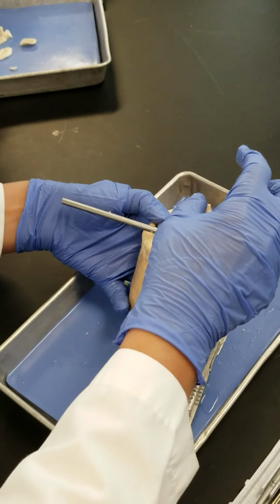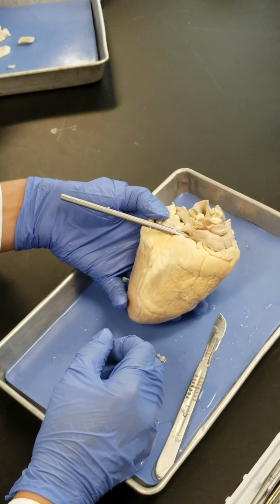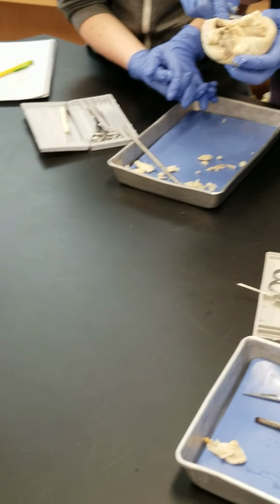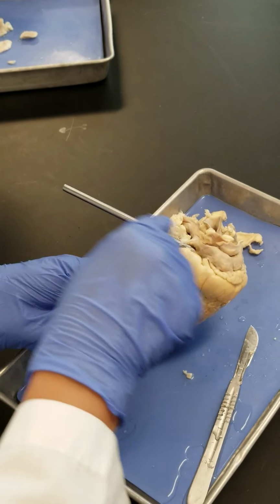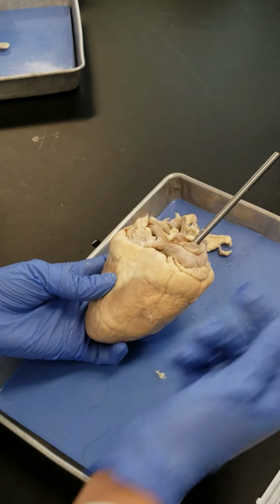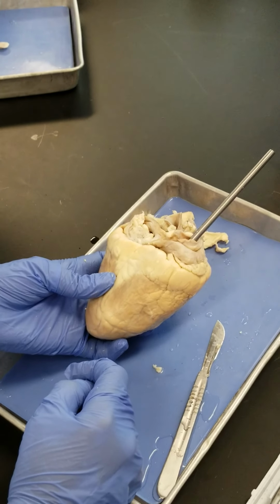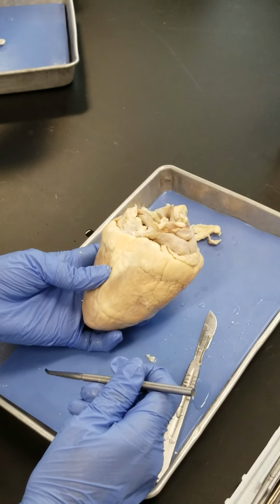So any question regarding the right atrium and the two vena cava that are going into it? We haven't found the inferior one yet? And pay attention to the direction that I put the probe inside. This one is going toward the right atrium, right? This one also is going toward the right atrium. This is the superior vena cava, that one was the inferior vena cava, right? Any question about the right atrium?